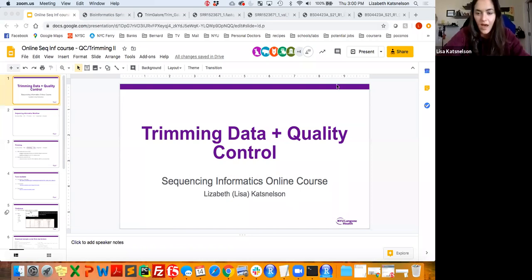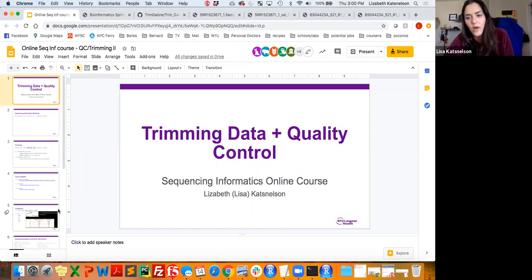Okay, hi, I'm Lisa, for anyone who wasn't here at the last lecture on Tuesday, and I'm going to be talking to you today about trimming data and further quality controlling.